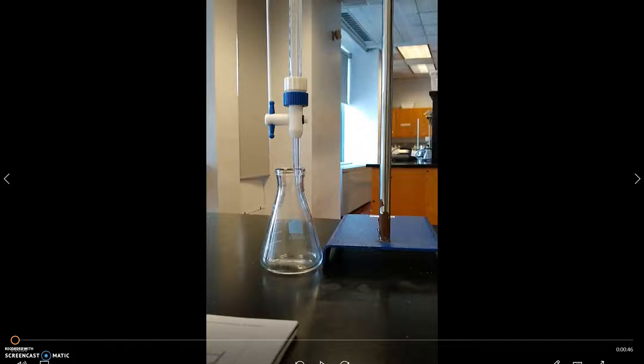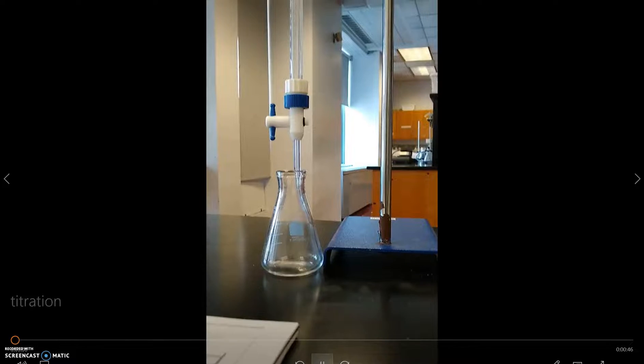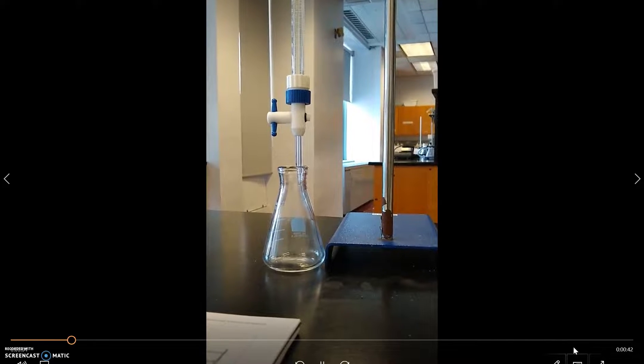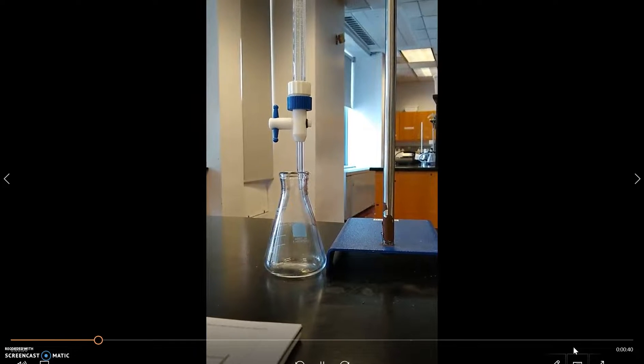Last but not least we'll analyze purity using titration. And this is just going to enable us to analyze the relative purity of the crude and purified products. This is of course a quantitative technique. You're going to be measuring volumes carefully and recording them. So I don't want to spend too much time talking about this. We've done plenty of titrations over the course of the semester. You'll be doing three rounds of them.